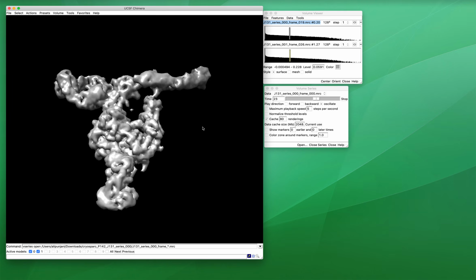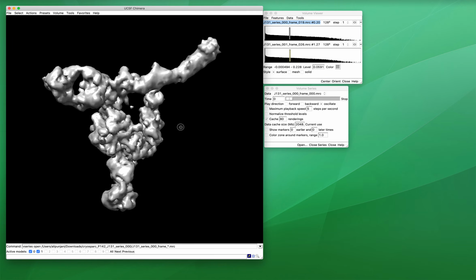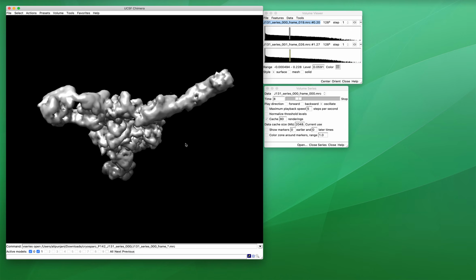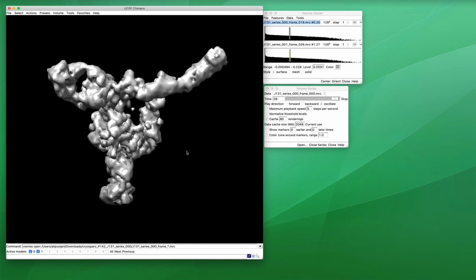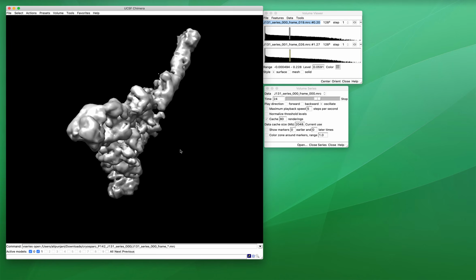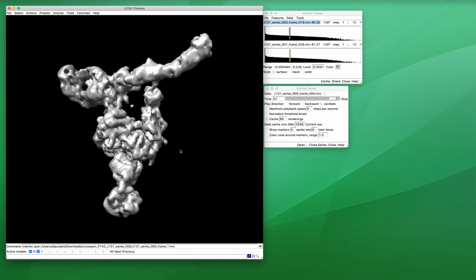And we can see that it's learned motion of multiple different parts at the same time. And this is just one dimension of motion and just one straight line trajectory through the latent landscape. And of course, across the latent landscape and in different directions, the deformation may be different. There may be other kinds of motion present, and we really have to explore that latent distribution using this generate job to see exactly what the model has learned.